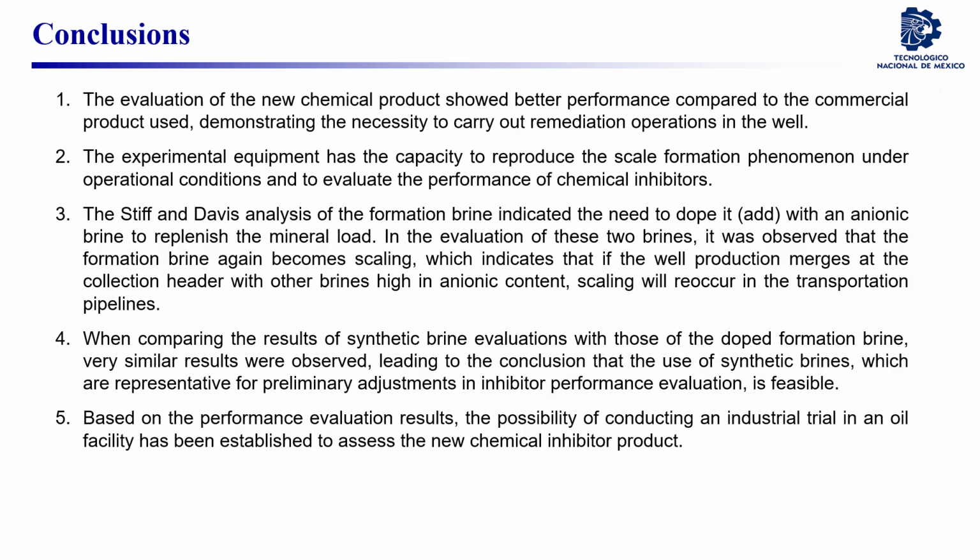The evaluation of the new chemical product showed superior performance compared to the commercial product used. The dynamic experimental setup has the capability to reproduce the phenomenon of scale formation under field conditions and evaluate the performance of chemical inhibitors. The formation brine needed to be dosed with an anionic brine to restore its mineral loss. It was observed that its scaling nature recovered.